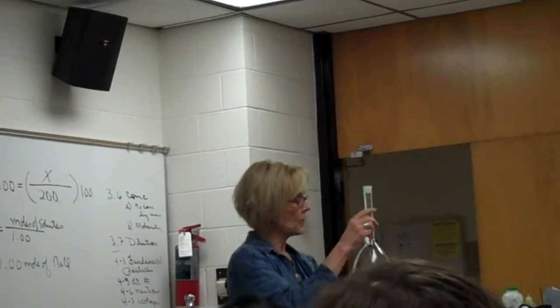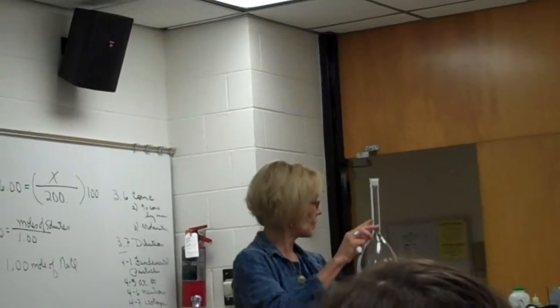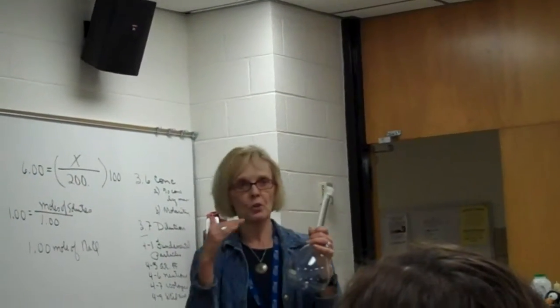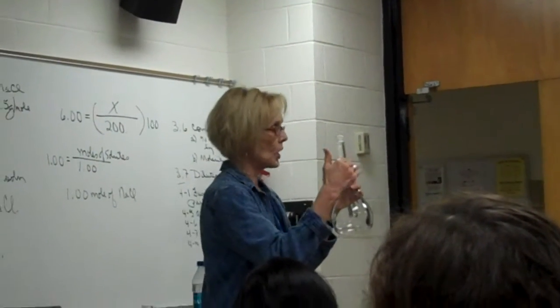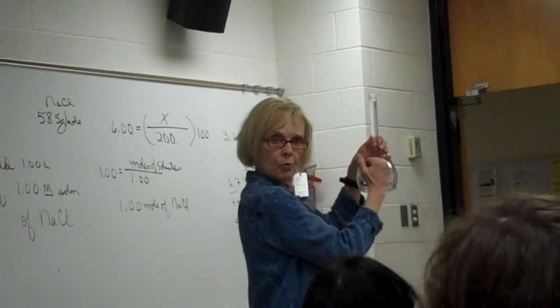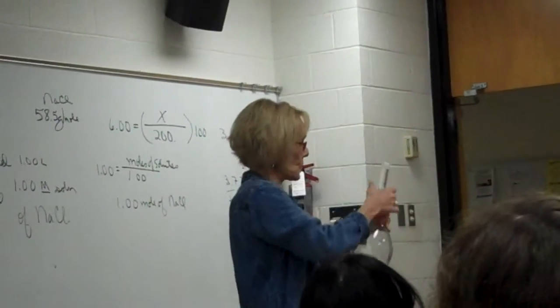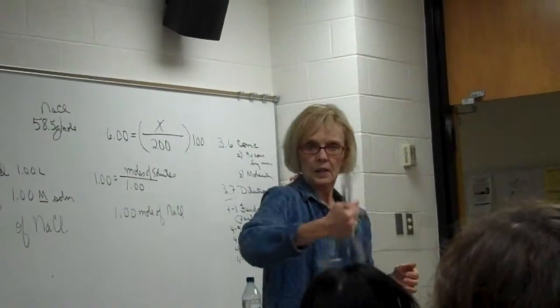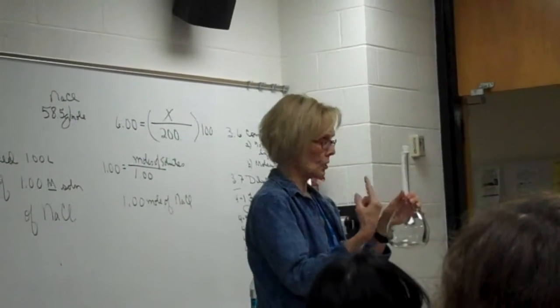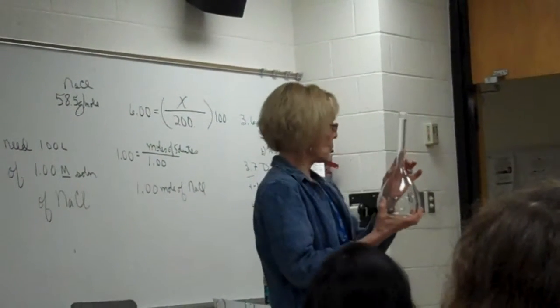So when you start up the neck, because it's very narrow, you want to be very conservative, not to overshoot the line. Now, in reality, we don't do it quite like that. What we do, generally, we're real conservative, and we put some distilled water, maybe halfway up here, then we shovel the salt in, and then we stand and we stir, either the old-fashioned way or with a magnetic stir that does the work for you. And then you top it off with water.